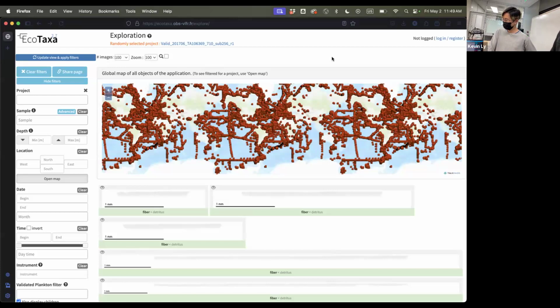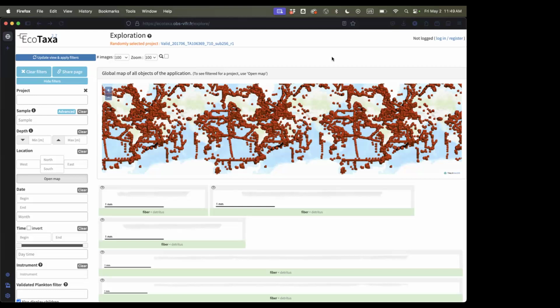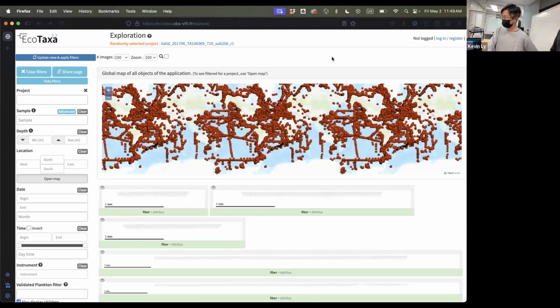The main thing is that you would need to select microplastics in a size range that the Plaktoscope is able to image. In some of the marine samples that I've processed, I've seen microplastic particles, although not in large enough quantities for me to really quantify. Yeah, there's a lot of interest in using it for microplastic work.